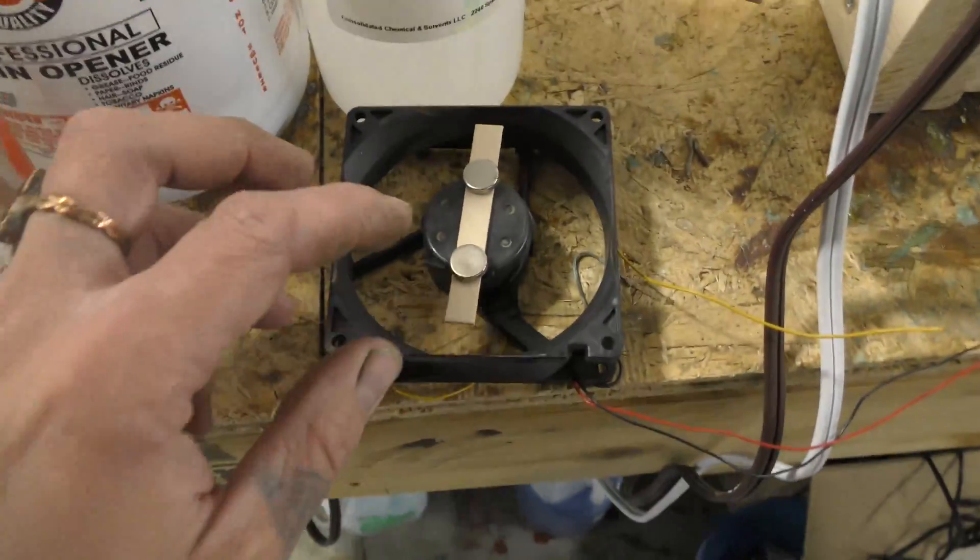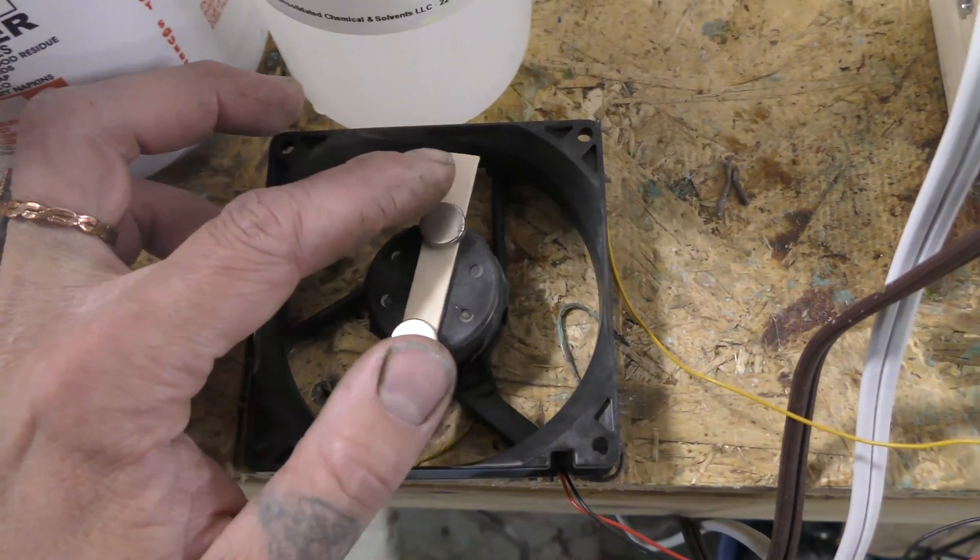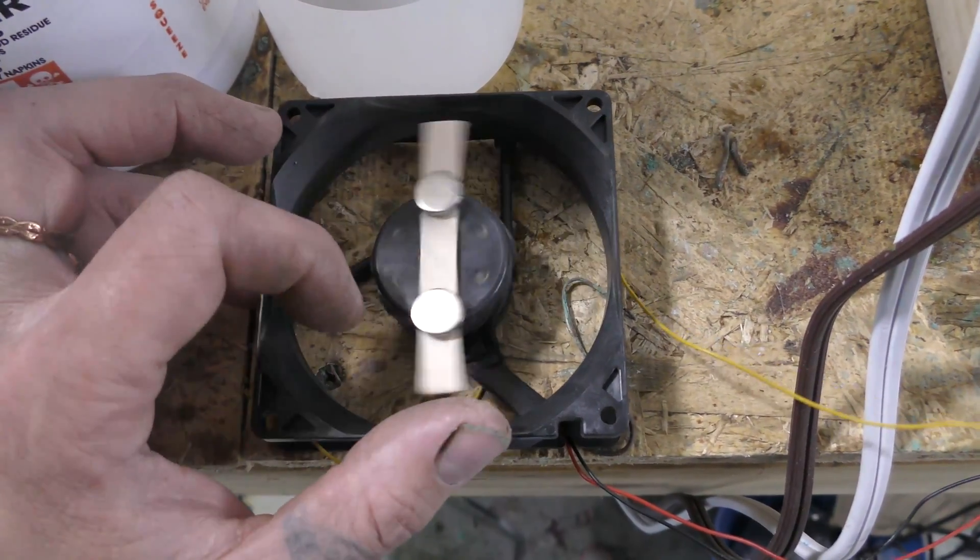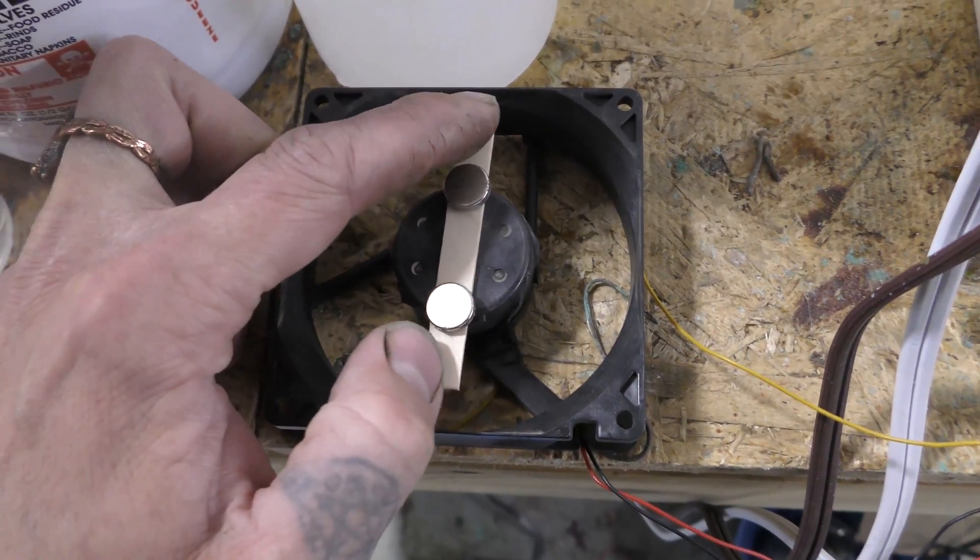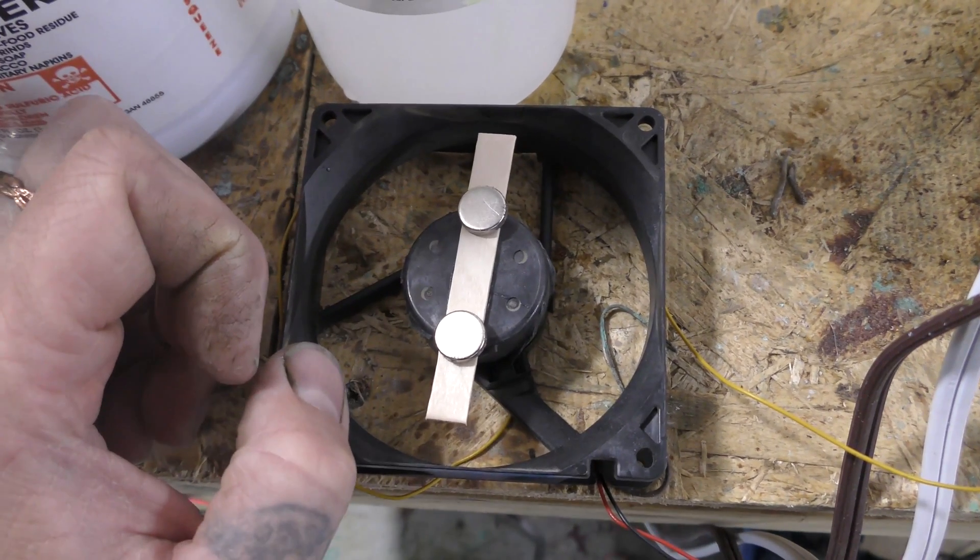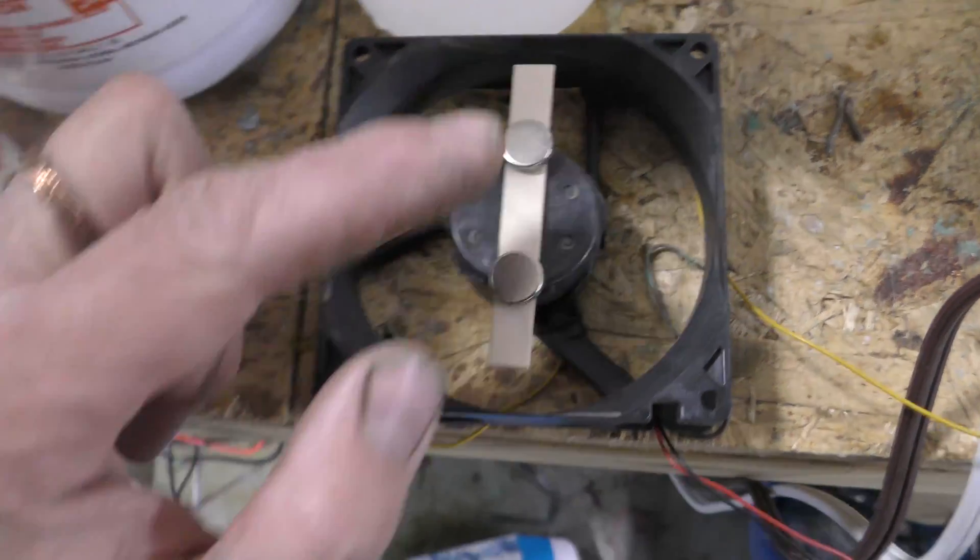So here's the alternates. This is homebrew. This is an 80 millimeter fan with two magnets and a popsicle stick. So here's the same two inch pill and here's some rings. This is a different type of tank. So this is my no texture tank. The other one has quite a bit of texture in it. And you can see it's dancing around pretty good. The liquid's actually flowing. Got a little bit of a whirlpool, but nowhere near the power of the other one.